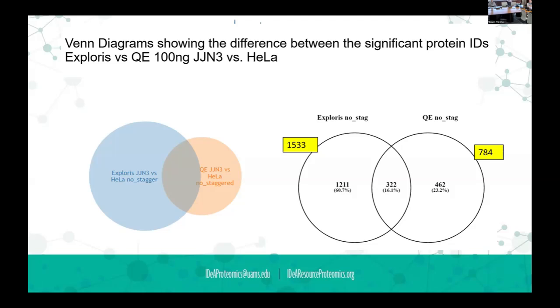The acquisition windows were significantly different, right? Not as different as it looked. That was the MS2 mass window. This is 400 to 1,000 on the MS. But it was 12 Thomson versus 20, and that's just due to the speed of the instruments.